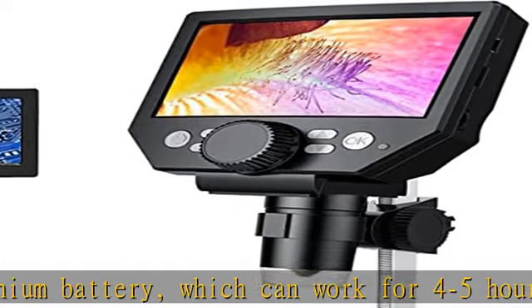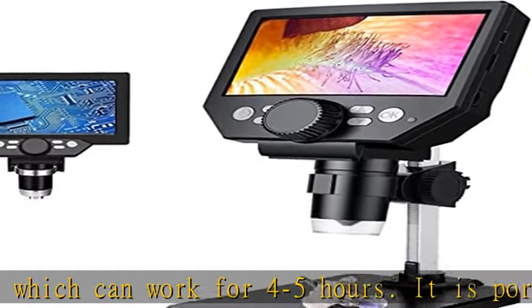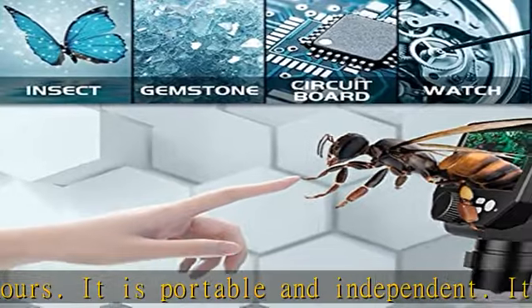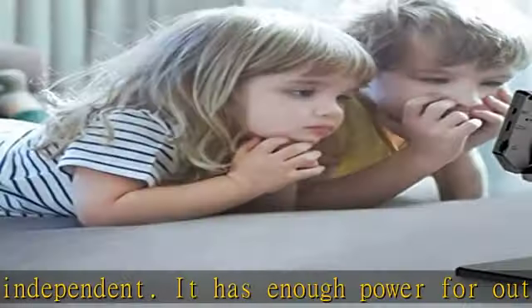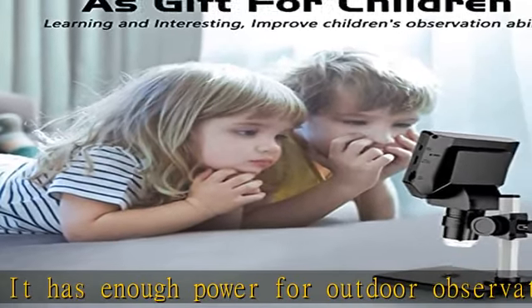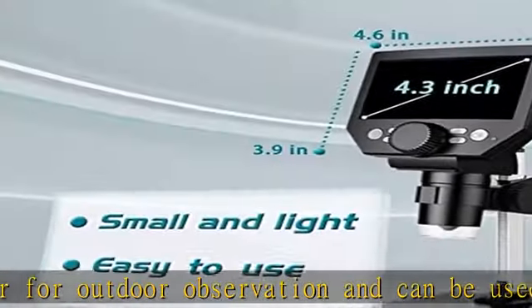The microscope has eight adjustable built-in LED lights. The brightness can be adjusted from dark to bright by sliding the switch, providing excellent details and best definition to improve the quality and clarity of the user's images and videos.